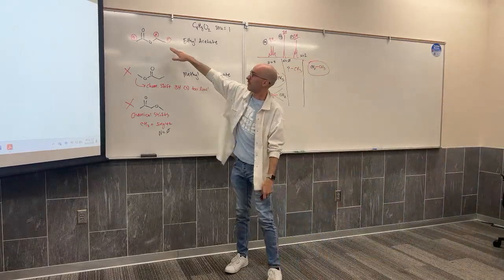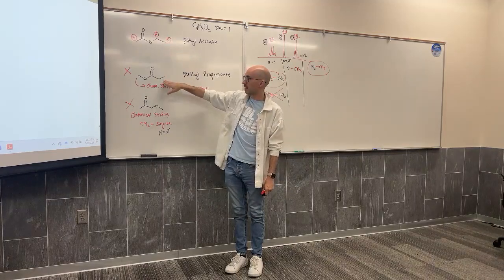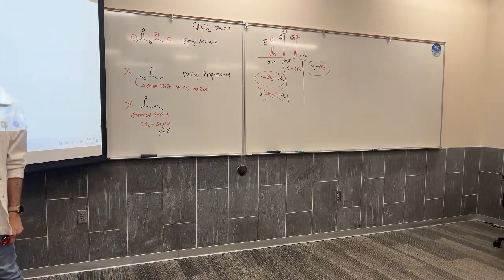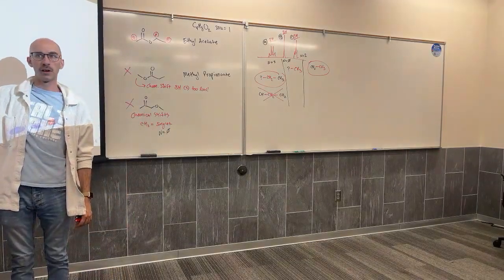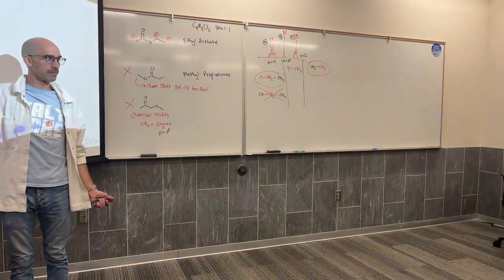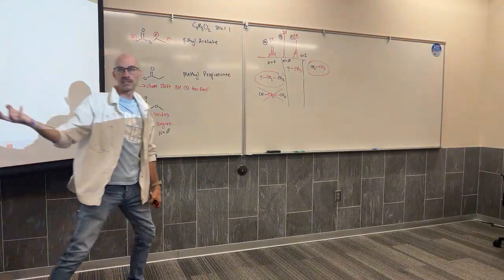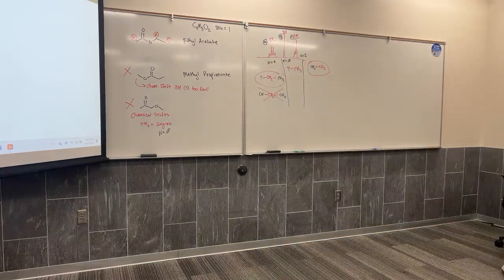Again, this was the compound whose IR we looked at on Tuesday. This compound's IR has sp3 C-H, a C=O double bond, and a C-O single bond. We can't tell how this molecule is structured. We can only tell that it has the same bond types. Then, let's look at the other structural isomer.